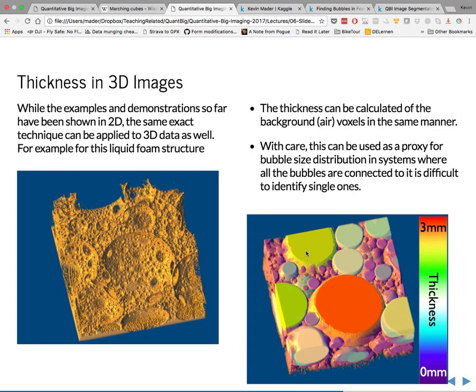But yeah, to then try to take this and say, now we'll try to identify which of these pixels belong to which bubbles, is still a complicated task. It doesn't make that task any simpler, but for many things it allows you to completely skip that task. To say, actually, we're not concerned with where that boundary is, we're concerned with how big these pore spaces are.